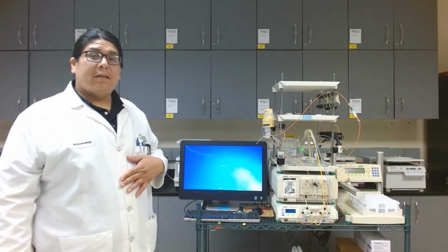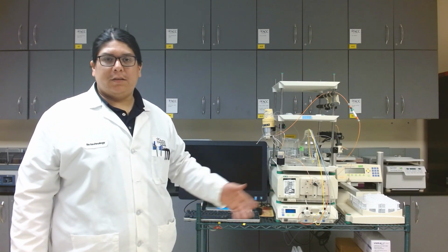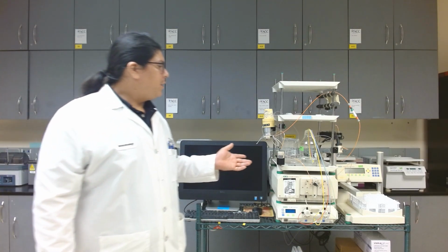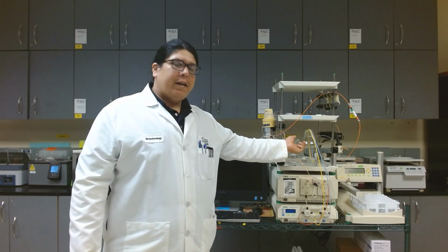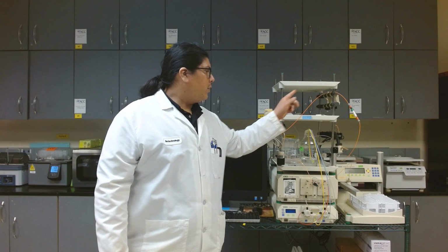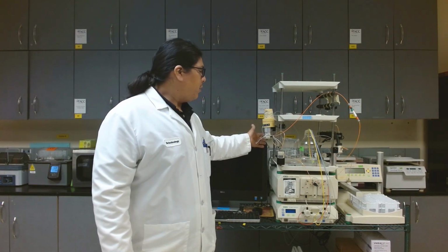I'm Jeremy Garza. This has been the general operation procedures for running the Biorad Duoflow FPLC system. If you're new to these systems, I just want to remind you one more time not to be intimidated by them. There's a lot of tubing and parts here, but if you keep track of where your mobile phases are entering the system and flowing around the system and exiting, either at the fraction collector or the waste container, it will make the learning process that much easier. And good luck on your purifications.